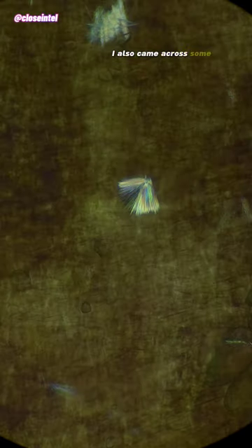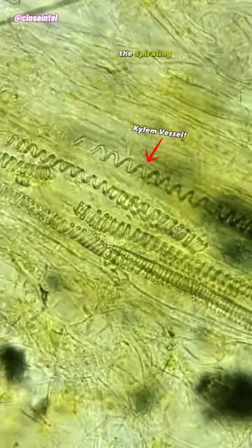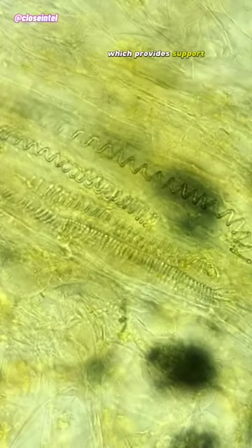I also came across some xylem vessels, which help transport water and minerals throughout the plant. The spiraling-looking structures you see inside is the lignin cell wall, which provides support to the vessel.